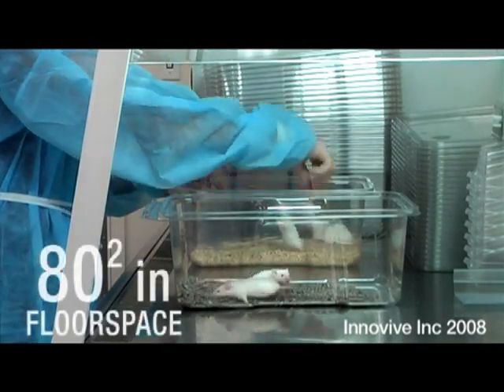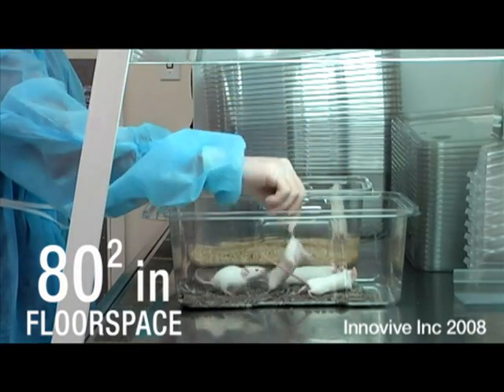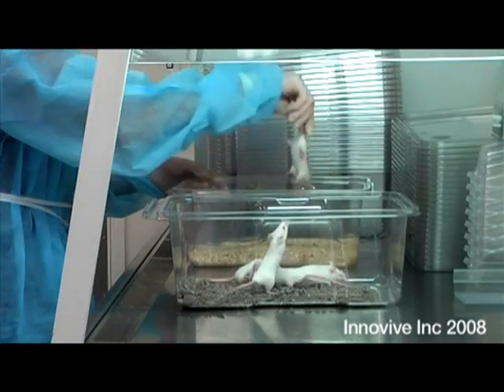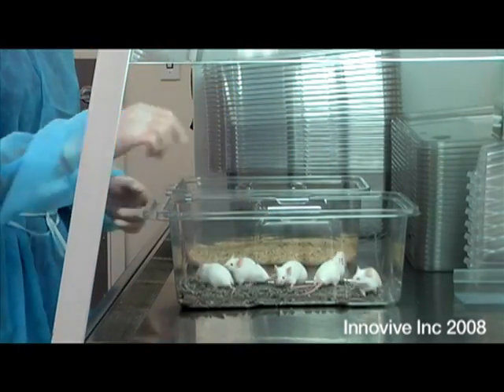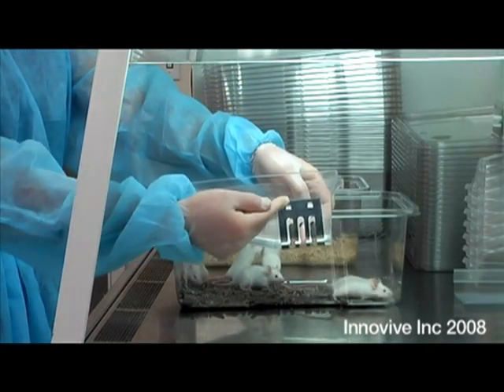Transfer your animals to the clean cage. It can accommodate up to five mice. Add feed to the food tray — do not overfill.